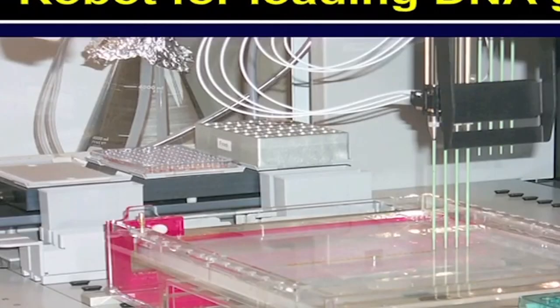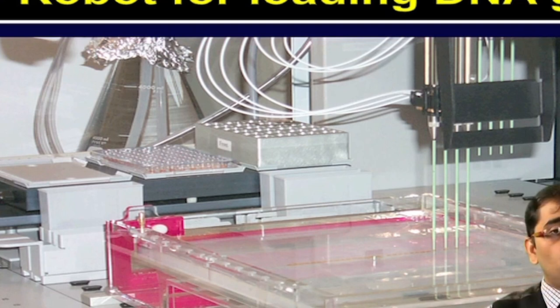These images will provide you a glimpse of various steps involved in high throughput cloning and how one can perform these experiments in a high throughput manner. This image shows you the high throughput platform for loading DNA gels. A robotic system is used here, where 192 lanes can be loaded in only 20 minutes.